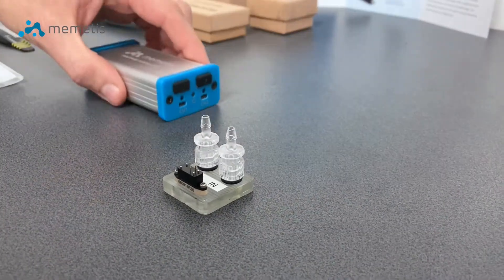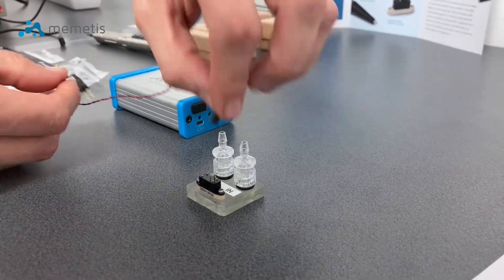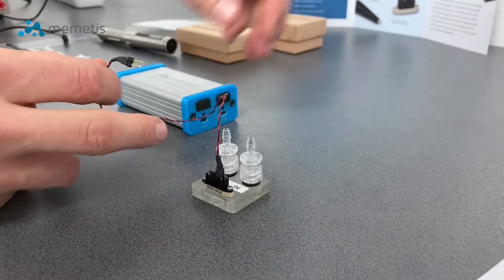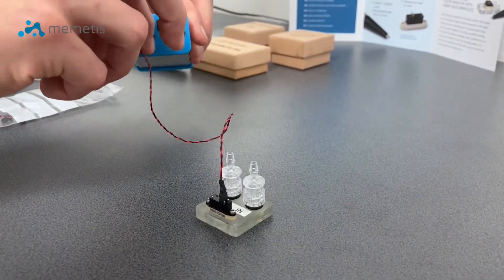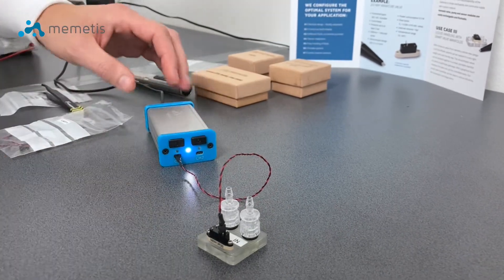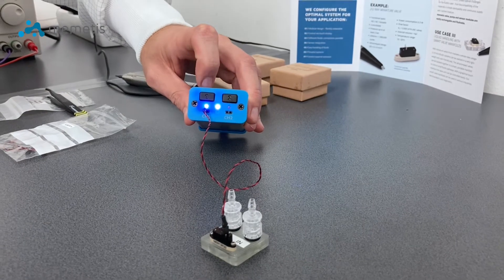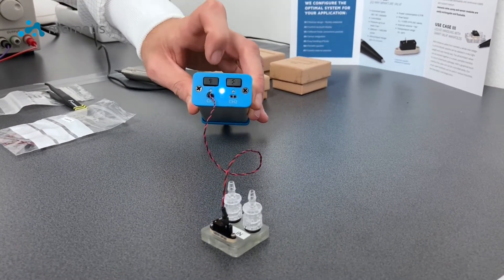Now, as a final step, you need to set up the electrical control. Therefore, you just have to connect one of the cables provided with the electrical control unit. Next, the electrical control unit is connected to the power source. And by a push of a button, your miniature valve will be opened or will close.